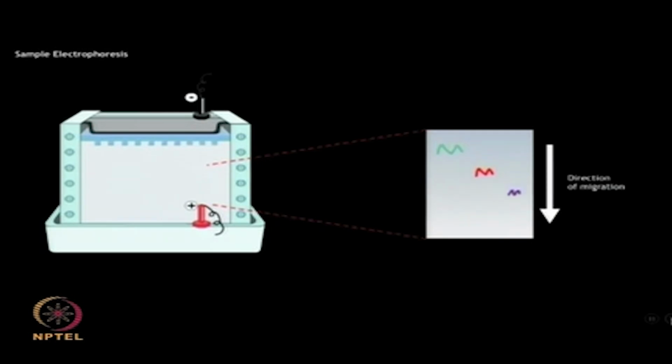The progress of electrophoresis can be observed with the help of a tracking dye. The larger proteins are retarded in the gel and remain close to the point of application, while the smaller proteins migrate further along the gel.